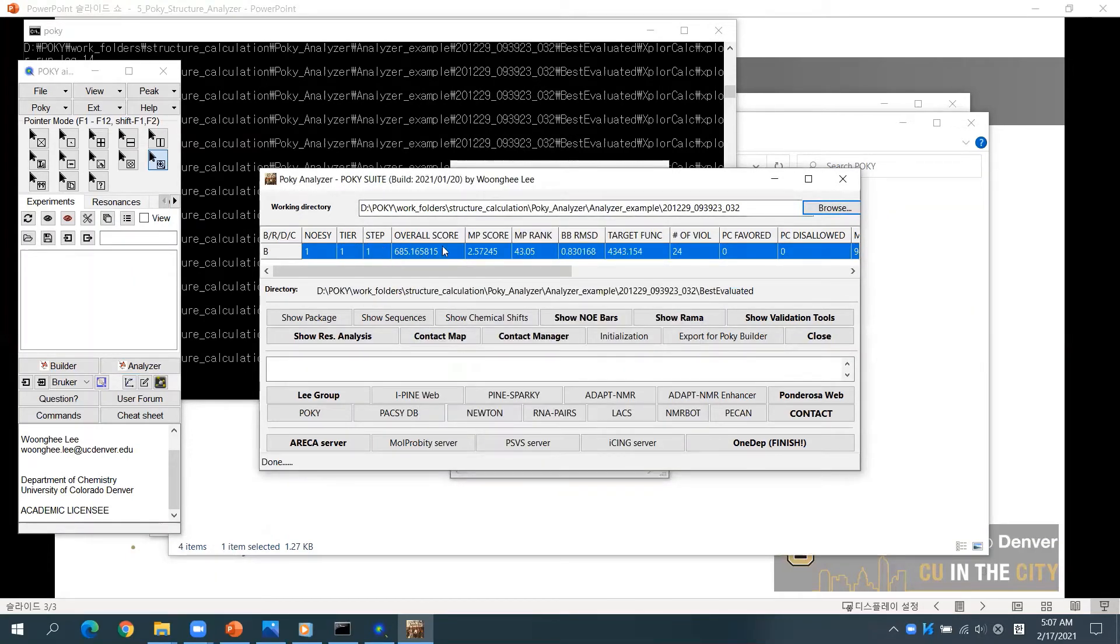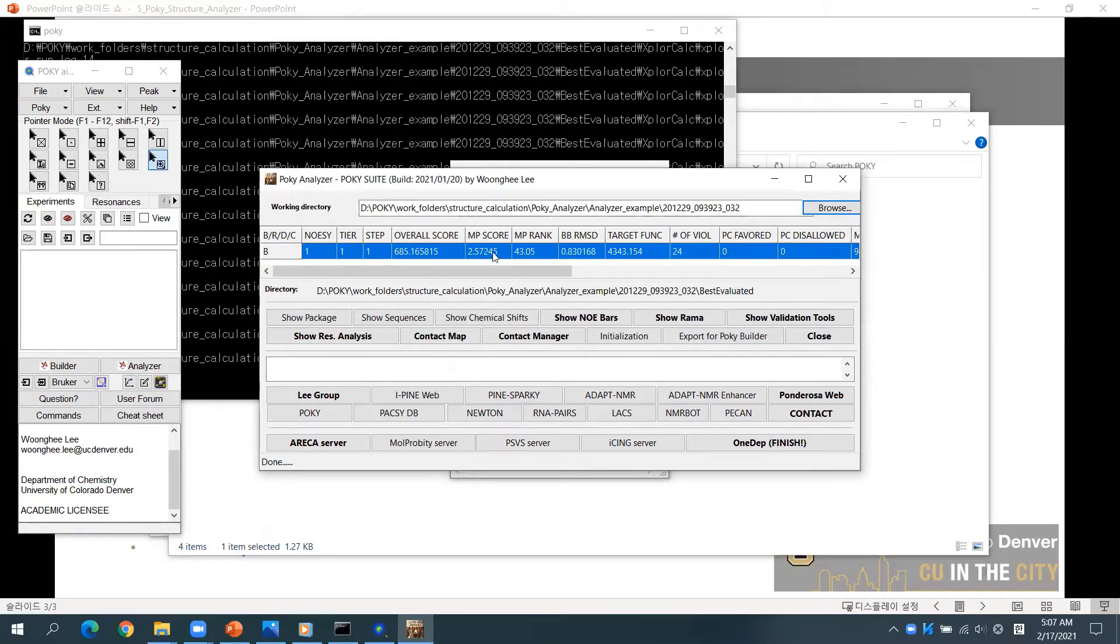Then you will find brief statistics including the overall score, model probability score, backbone RMSD, the number of violations, and so on.